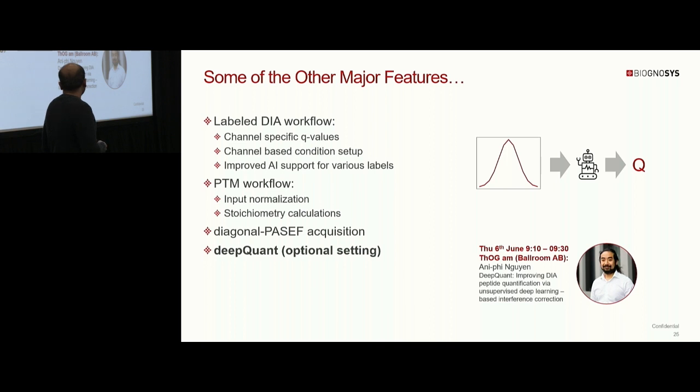And finally, but not the least, we also have this new deep learning model, which basically corrects the interference using AI. It's an optional setting, so none of the things I showed right now are based on this. And there's a talk by Anfi where we'll explain on Thursday. So again, I recommend attending that talk.